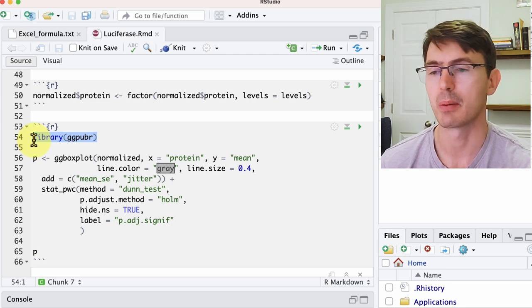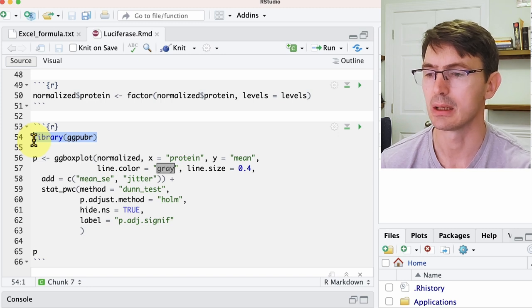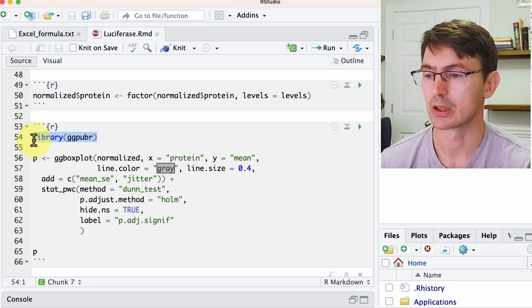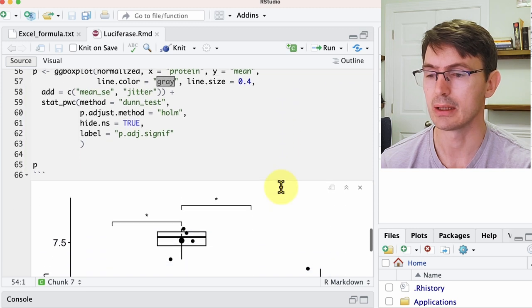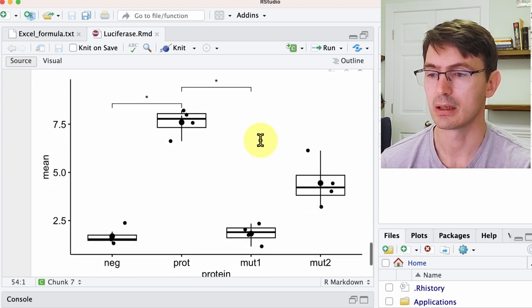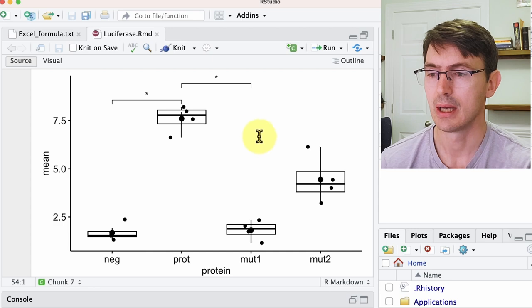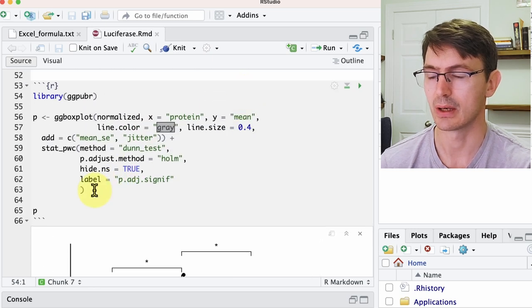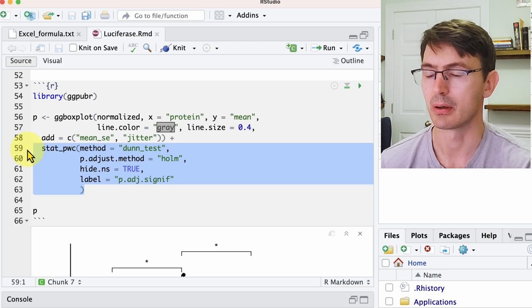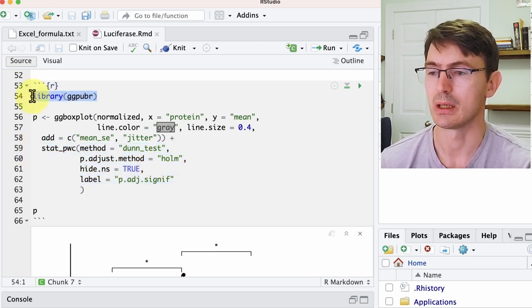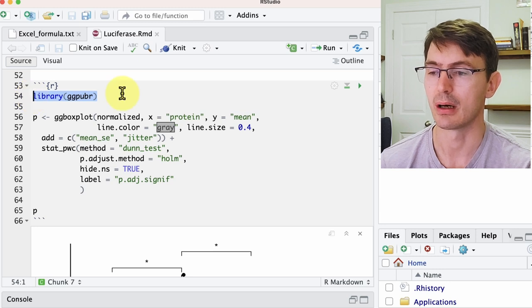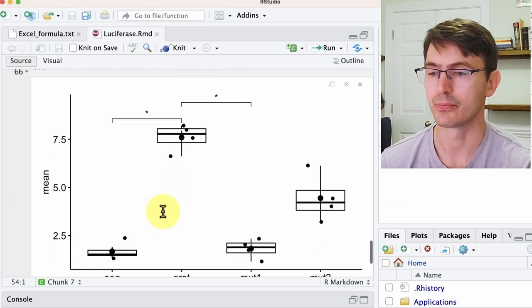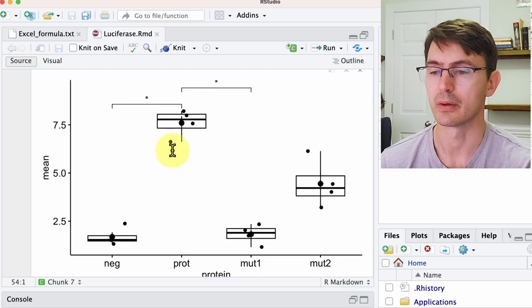And we plot using this ggpubr library that is a wrapper between ggplot and a statistics R library. So if you run this, you have the plot that I have shown you in a second. And this statistic is added using this function here that is the wrapper of the stats R that is within the library, the ggpubr library, and allows you to do these comparisons over there.